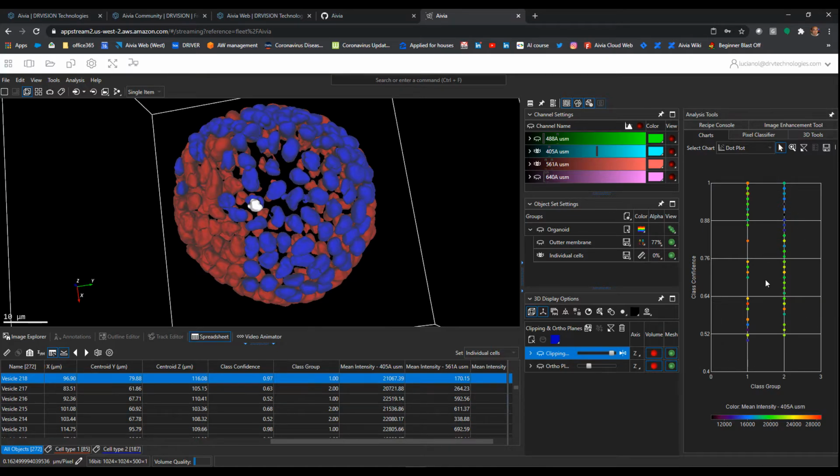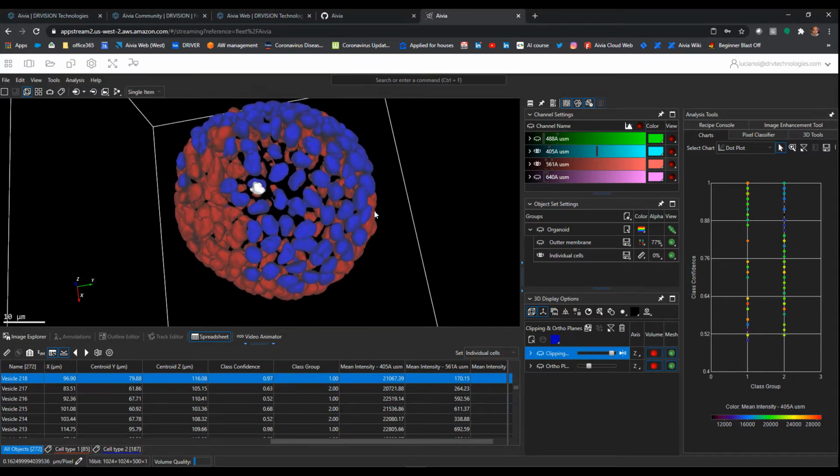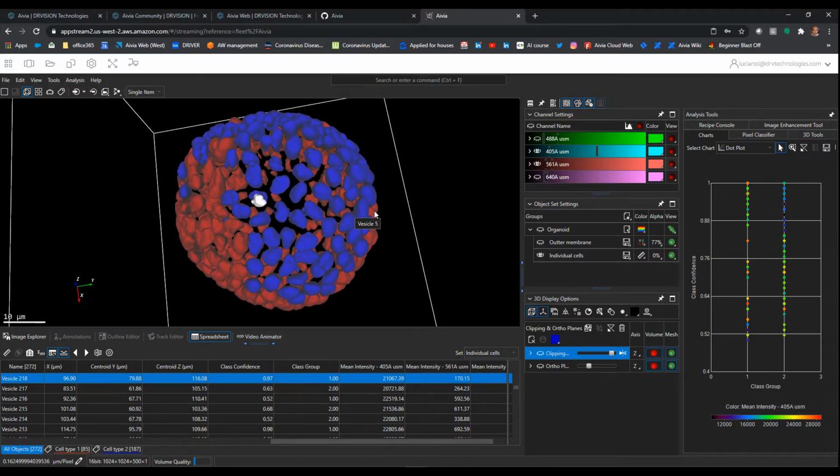Now over to Japan. And just one last note, during my demo I was using Aivia Web, a server back on the west coast of the US, while I'm in Lisbon. So of course, in that case, there is a little bit more latency than normal, but it's still very much usable and quite a lot of fun.